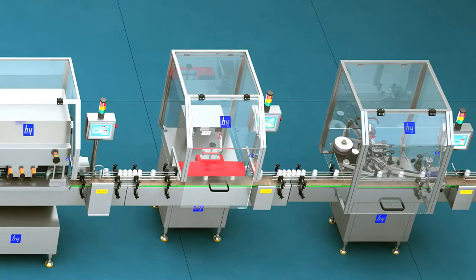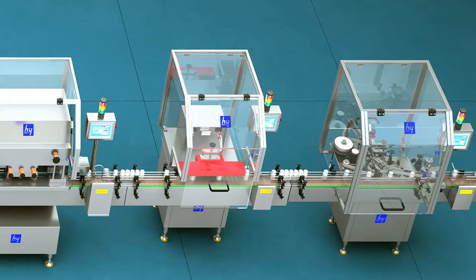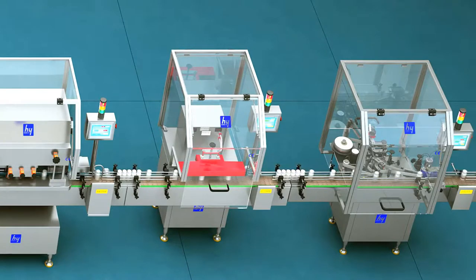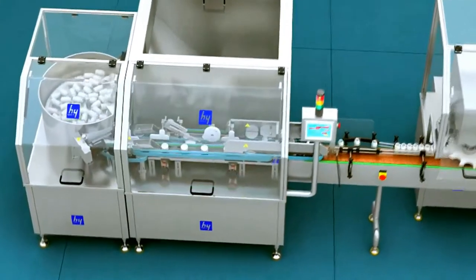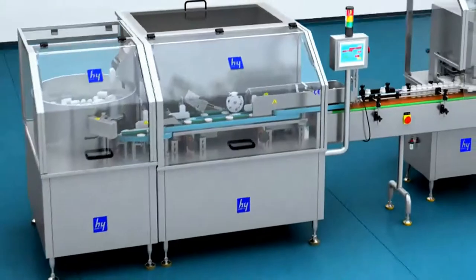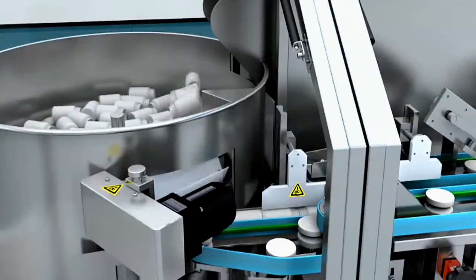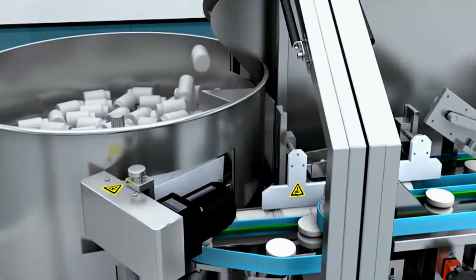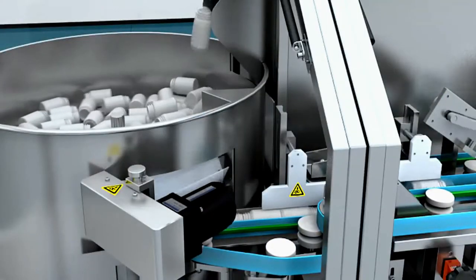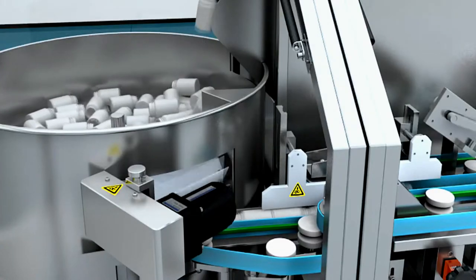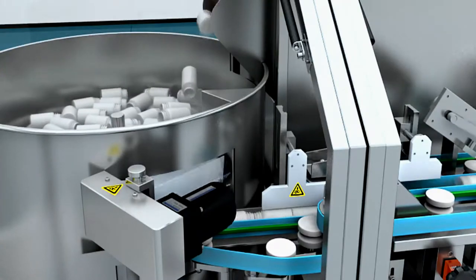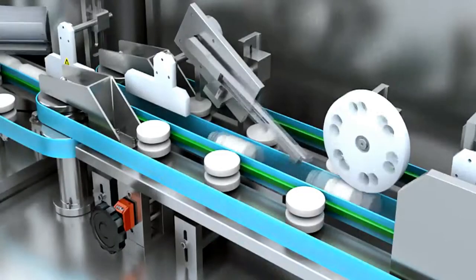The characteristics of the high-speed automatic unscrambler are high-speed, stable routing, no clamping, and it won't damage the bottle and appearance, with high arranging qualified rate.